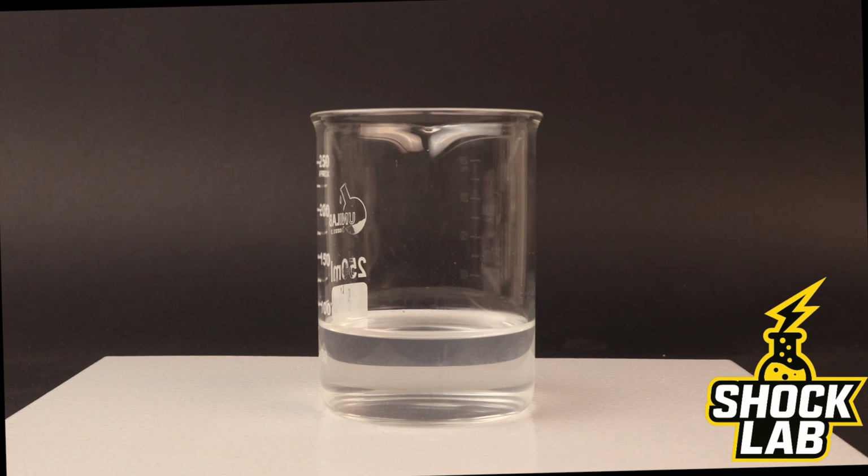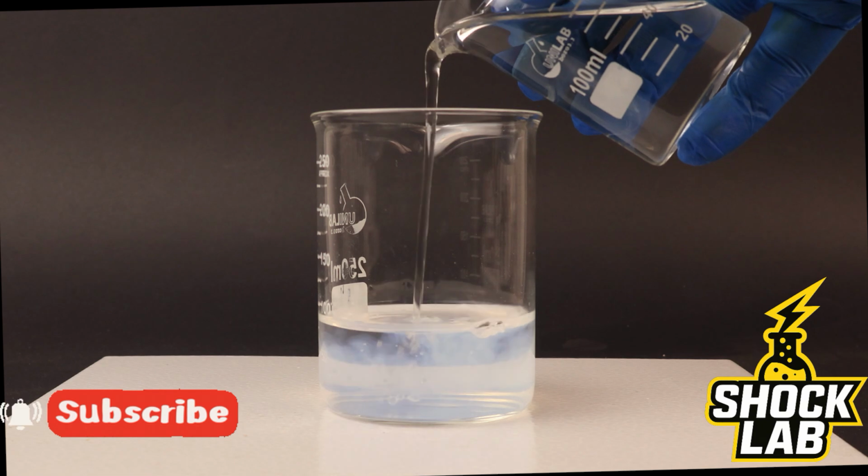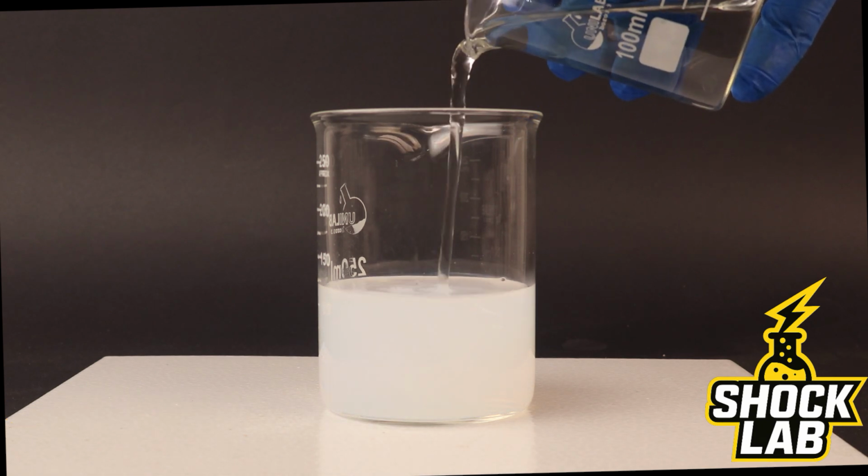This beaker contains a clear solution of silver nitrate. Now I'm adding sodium chloride solution. Instantly, a dense white precipitate begins to appear.